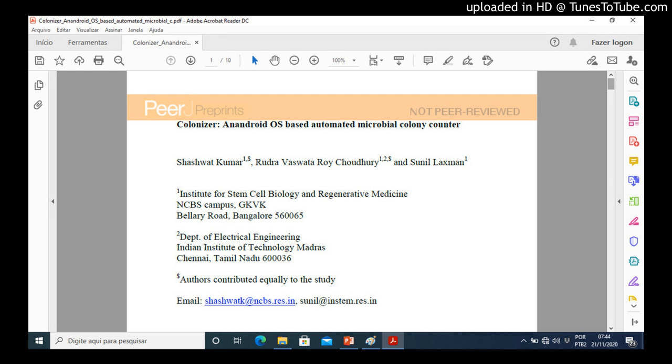This removes any noise from the edges of the petri dish. The advantage of this setup is that it could be built with readily available components to avoid noise due to glare, shiny colonies, foam shadow, etc., which can appear if the petri plate is imaged directly in ambient lighting. Testing on different phones.